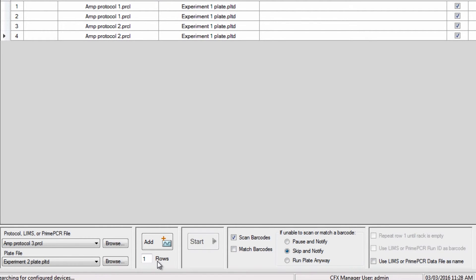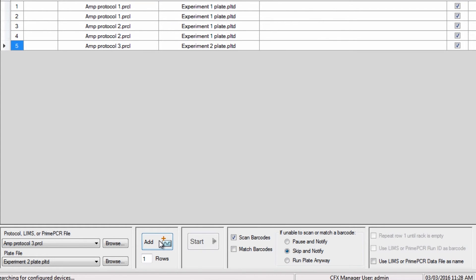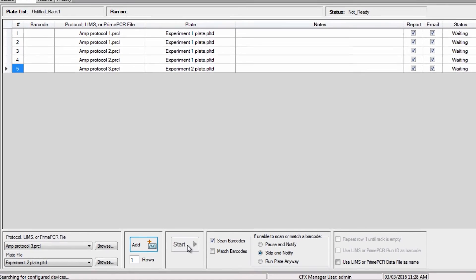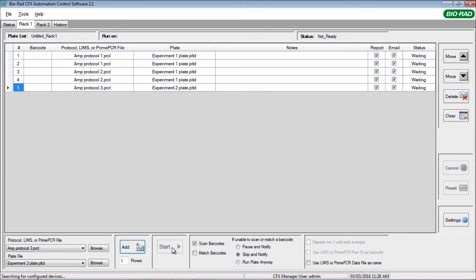Choose to add one or more rows to the plate queue and click Add. Load your plates and press the Start button, which will be active when you are connected to a CFX instrument.